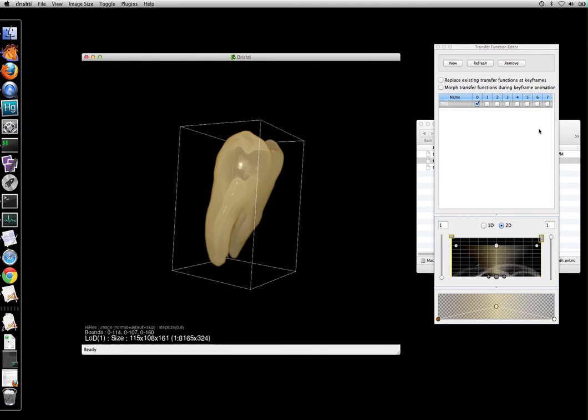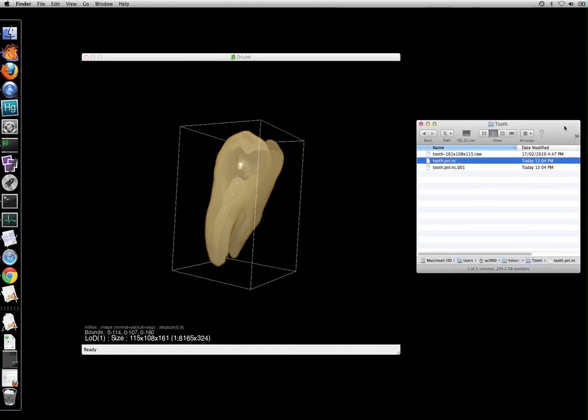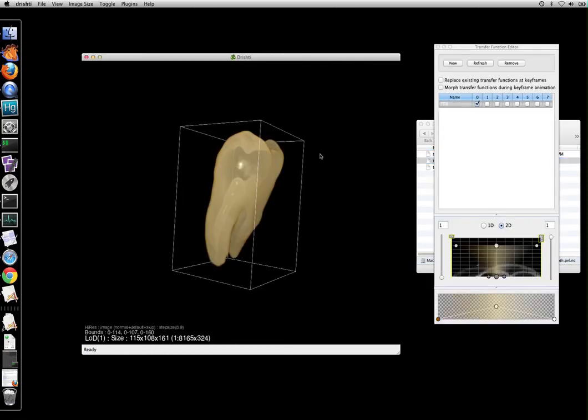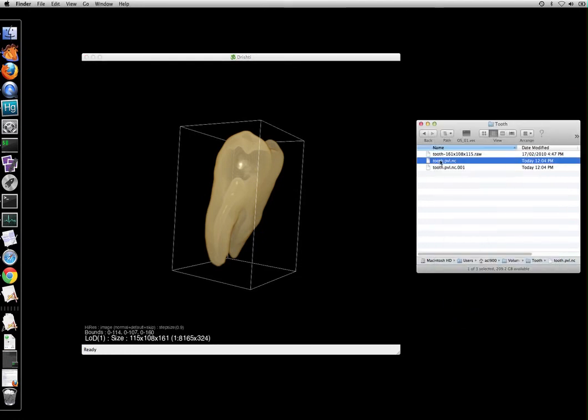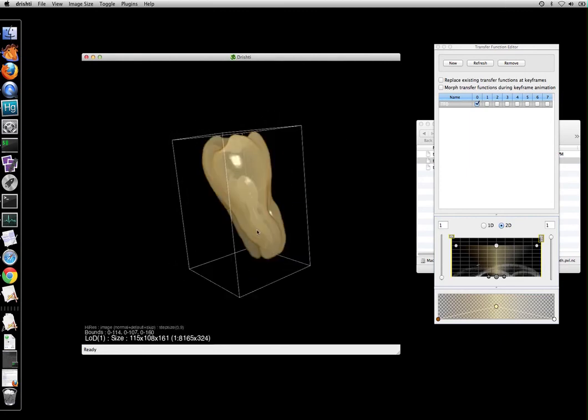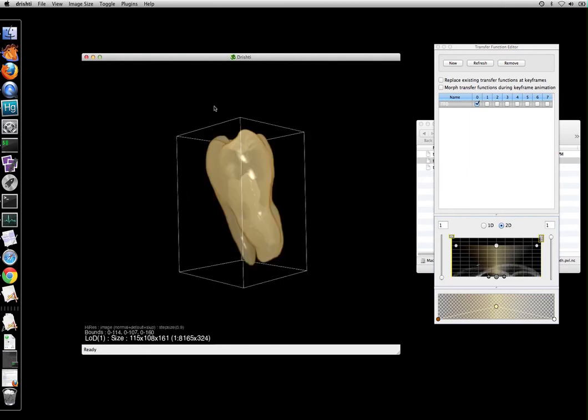So in this video what we have done is imported the data set tooth.raw. This imported data set got converted from raw file to tooth.pvl.nc and tooth.pvl.nc.001 file. Then we closed the importer and then started the render program. And in the render program we dropped the pvl.nc file. And we got our image.